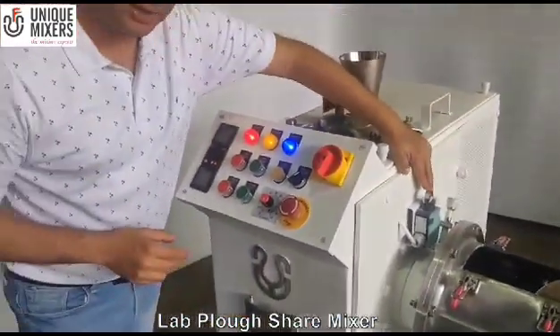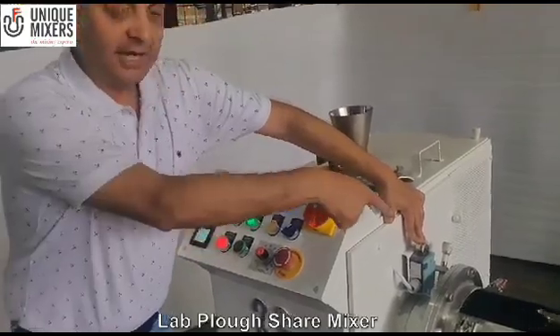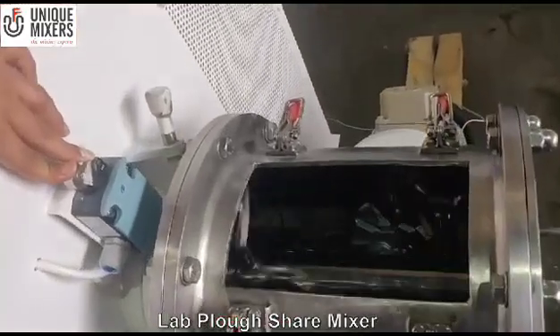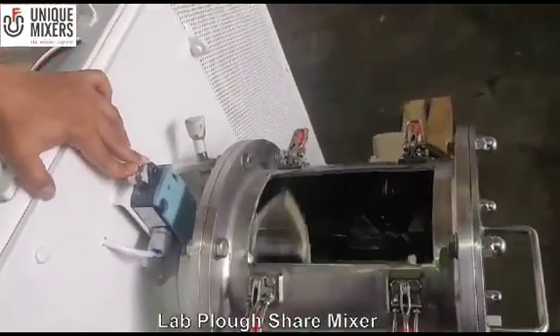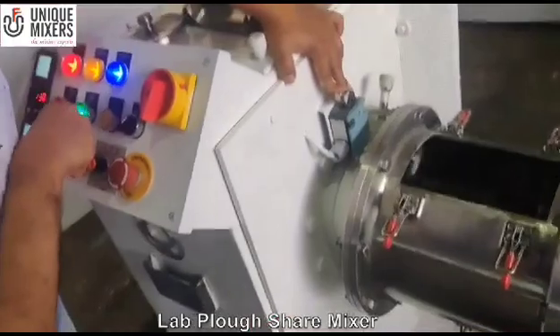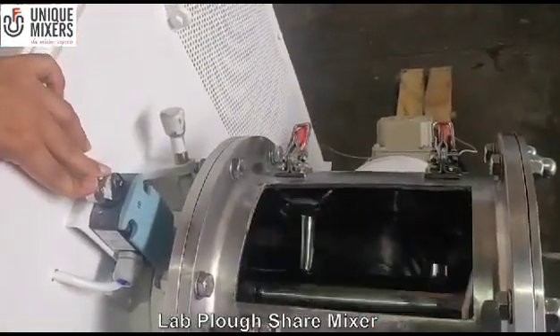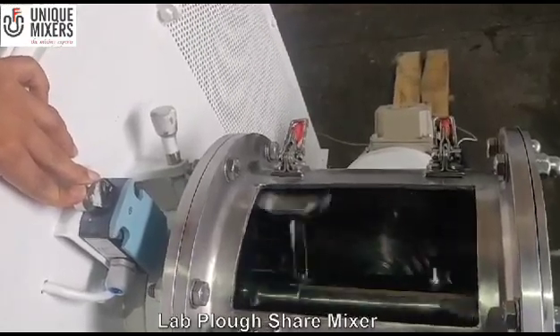Please don't do this in normal operations, but just to give you an indication. I have just started the mixer and there is a speed control, so it will accelerate to the maximum speed. We also have an independent operation for the chopper — the chopper motor is now started. The chopper will disintegrate any lumps or agglomerates that you may have in the product.